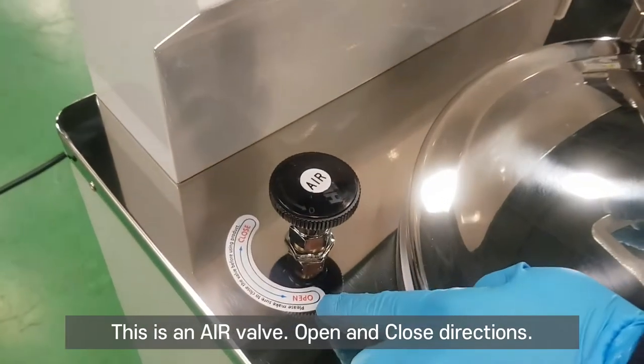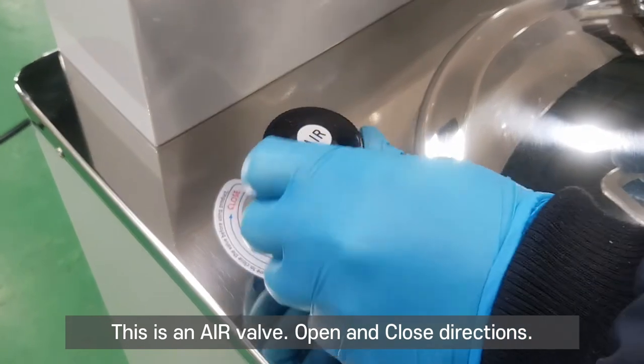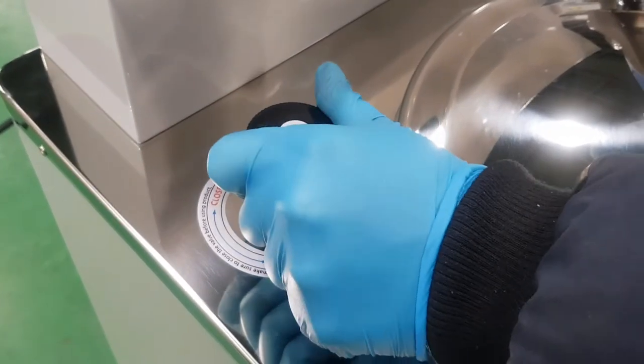This is an air valve. Open and close direction. It locks well.